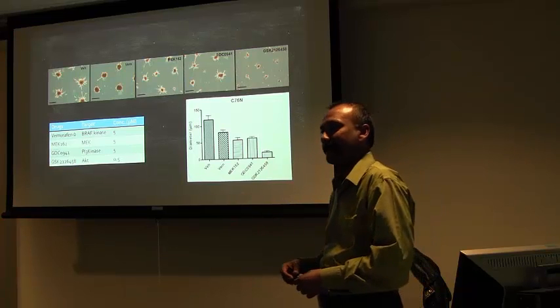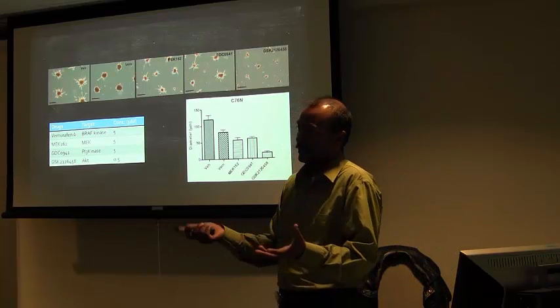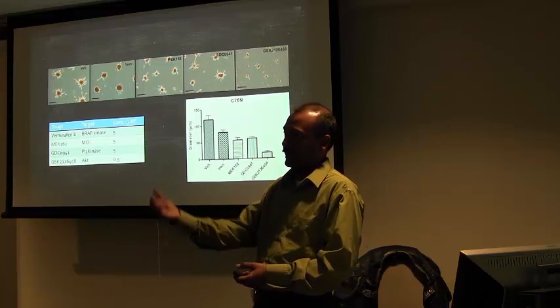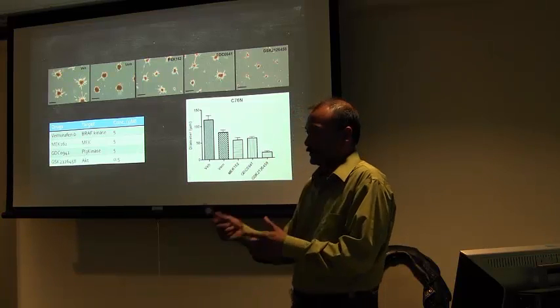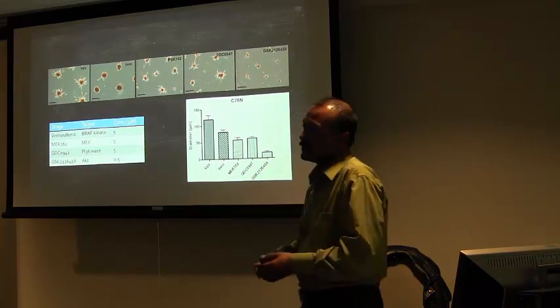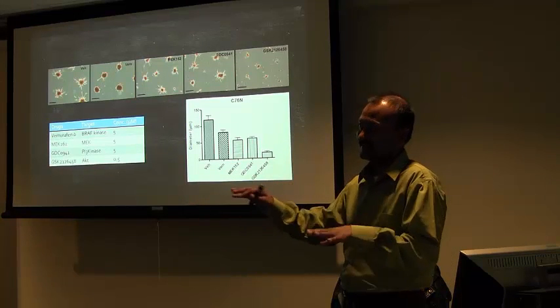So when you're doing the viability assay, were you looking at viable spheres and viable cells? I'm looking at viable cells. It's synonymous, because spheres are made out of cells. But what I do is I do two things. One is I directly do MTT assaying in the well, add the MTT reagent and wait for the color development, and measure in a plate reader. And in a parallel plate, I give it to my students to trypsinize and count the cells, so you see if it matches. So it sort of matches. Definitely more human error comes in counting cells, but it's in the same ballpark.